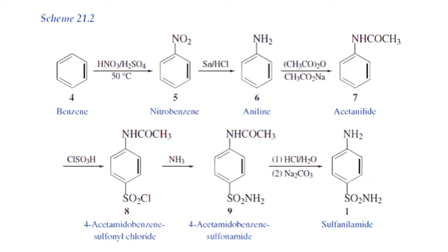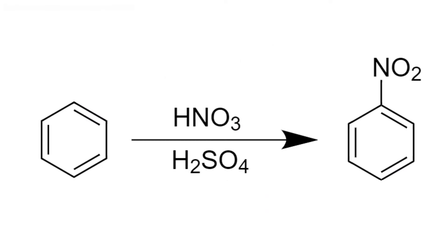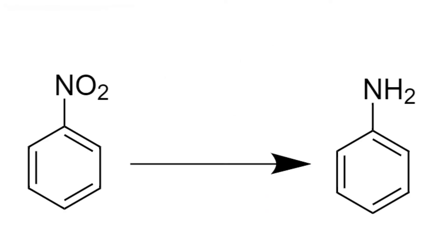In today's video, I am going to be continuing my sulfanilamide synthesis. We have already turned the benzene into nitrobenzene, so our next step is to reduce the nitrobenzene and turn it into aniline.